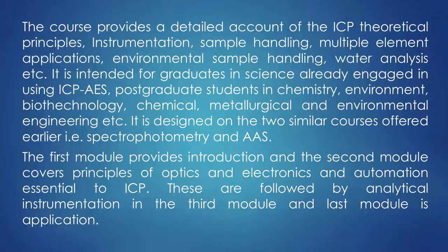You must have the knowledge of prisms, gratings and many other things which we continuously use in most of the instruments. If you have taken my earlier course on spectrophotometry or atomic absorption, this will be some sort of revision for you. I will try to keep that to a minimum, and if you wish you can go through those courses on fundamental principles of instrumentation and optics.